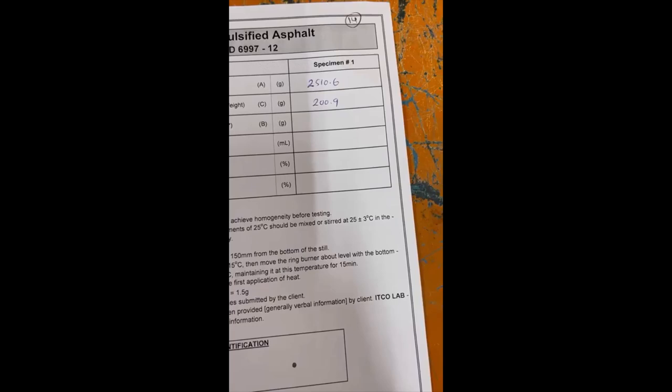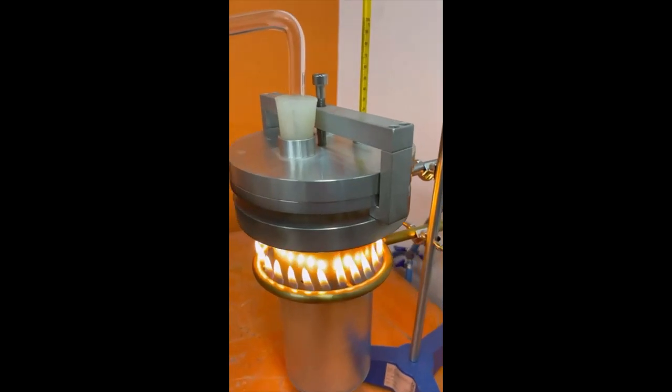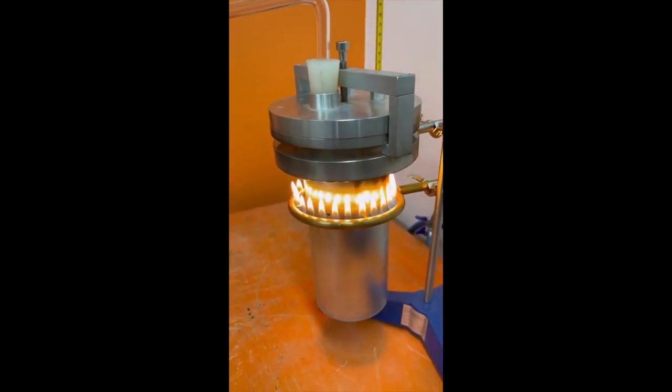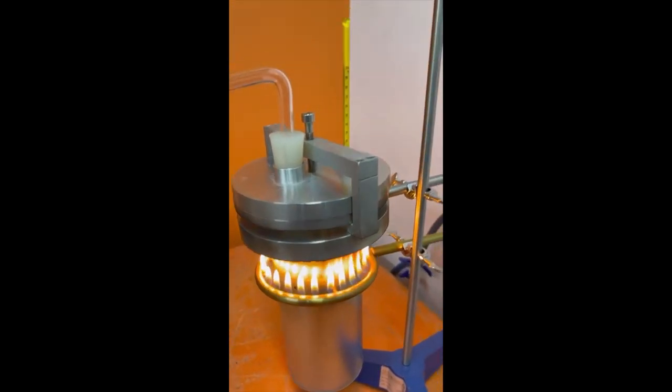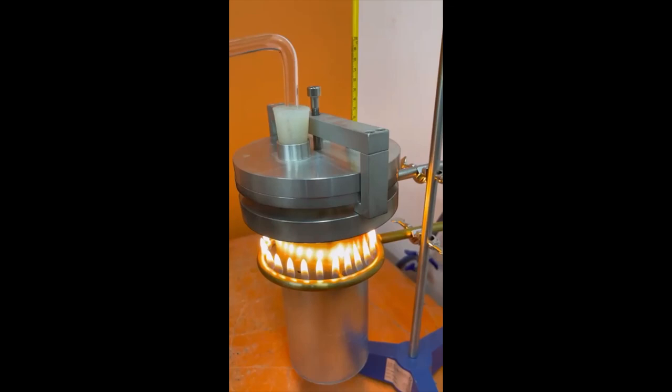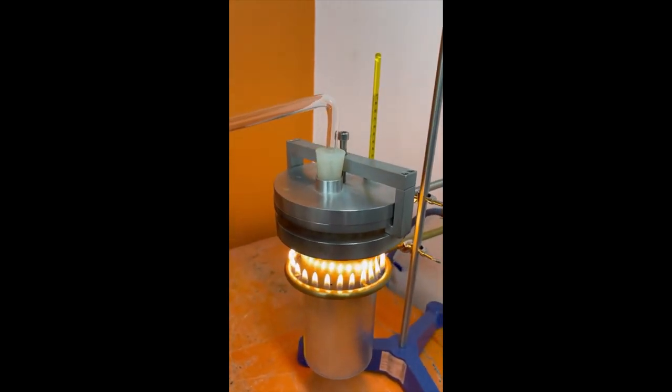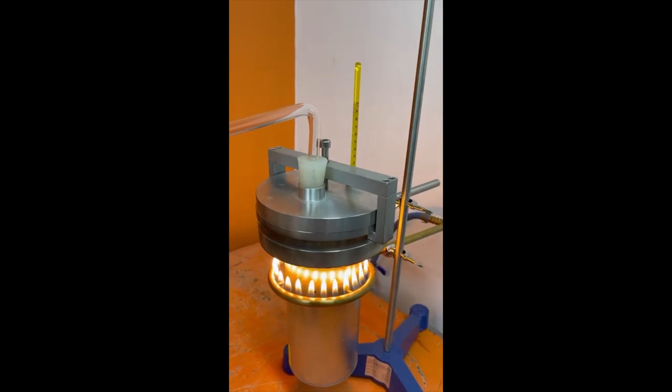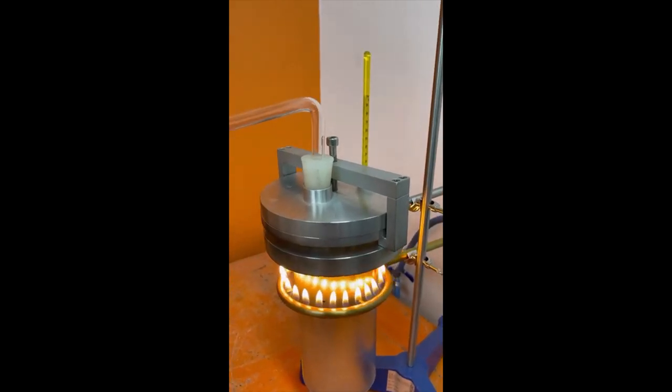Now we start the test. This is an aluminum shield and this is the ring burner with thermometer. Now we will wait until we reach the temperature 215 degrees. When we reach 215 we will bring the ring burner to the bottom of the steel apparatus.